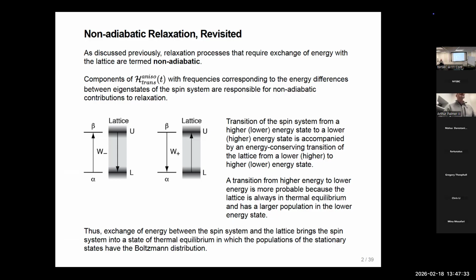Actually, you see temperature changes all the time, of course, when you turn on pulses. That has nothing to do with the spin system. That's the electric field that's generated in the coil, heating up the water, because these are close to microwave frequencies, and a microwave heats up water very efficiently. So in solid state, people try to design probes that are so-called E-free, where the field is largely magnetic and the E field is minimized in the coil, which means it's maximized somewhere else we don't care about.